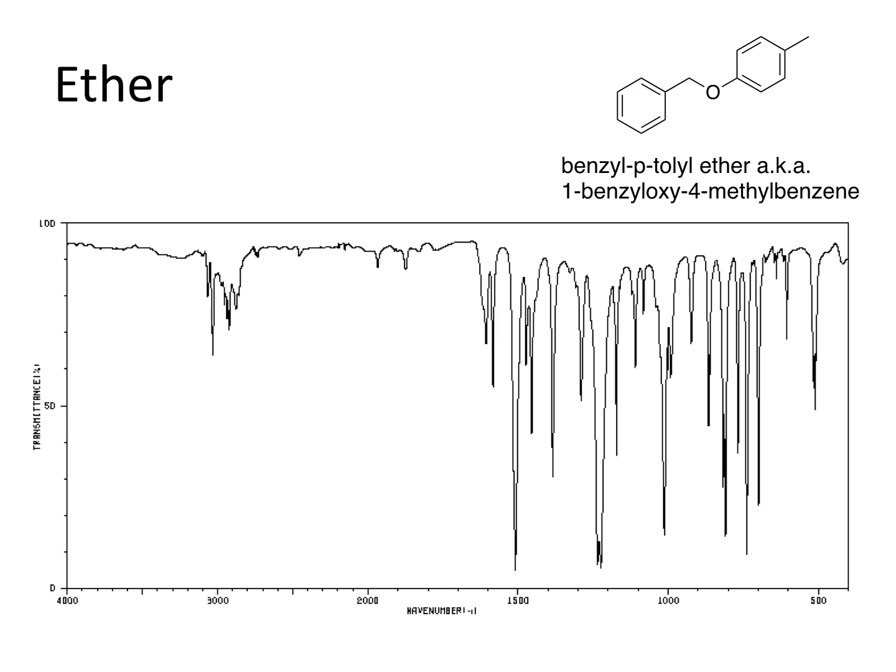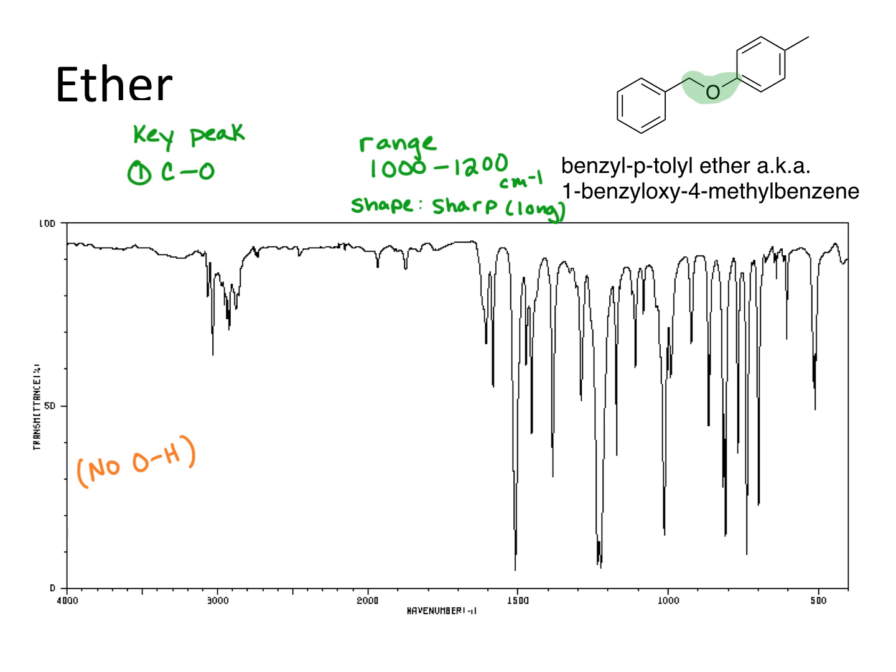But if you look at the next one, this is called an ether, right? An ether is a carbon-oxygen-carbon bond, so no H on there. So it shouldn't have an OH peak, which it doesn't. So if you look at that, you're going to have to look for a CO bond, which is something we saw in the alcohol, but it'll be missing the OH peak, and that's how we'll be able to tell them apart. So remember we said if we look on the range on the handout, it says it's 1,000 to 1,200. So we're going to look in that range and see if we see a peak that's really big. You see it? Yeah, it's right there, right? It's kind of right at the edge of the 1,000. So that's the peak we're looking for.